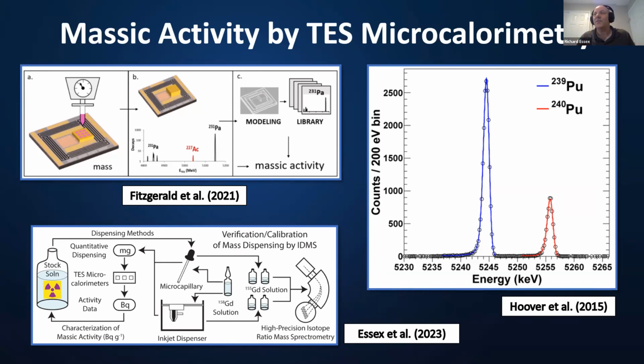you tend to have very small measurement apparatus that you're working with, something on the order of square millimeters of surface to put your sample on, something that's embedded in a gold foil, for instance.